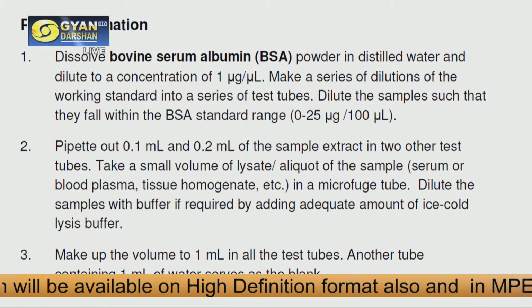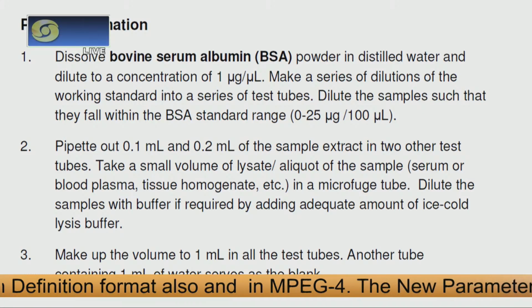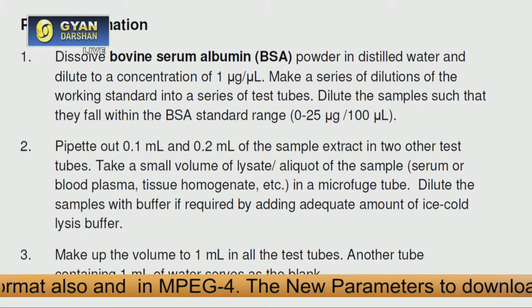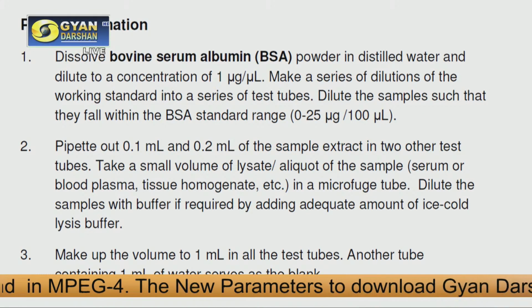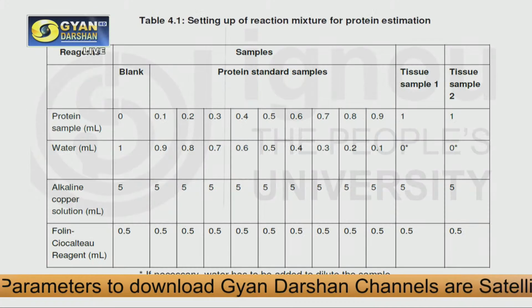So you prepare a stock solution of BSA, and then you can follow this particular table.